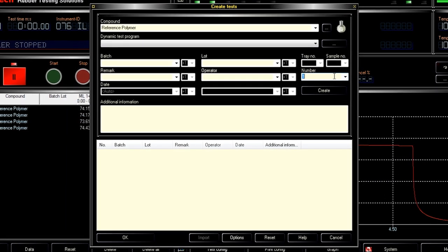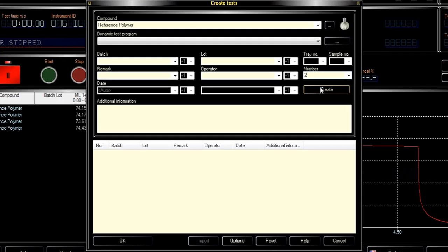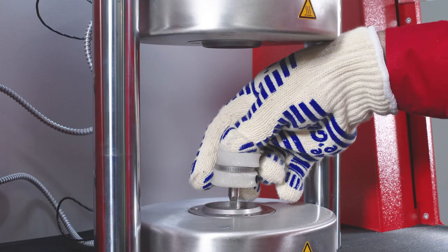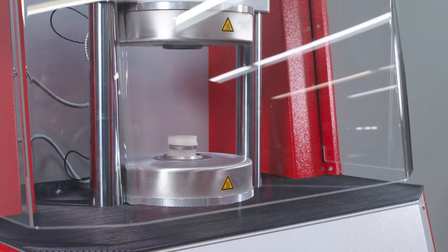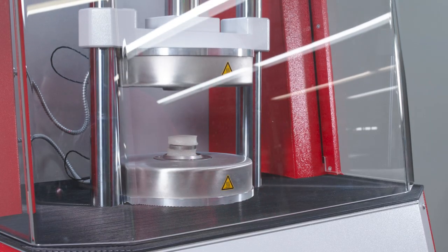Running a test is simple. Create a test sequence within MonControl software, load the rotor and insert it into the driveshaft, then press the start button. The instrument's safety shield lowers, its platens close, and the test begins.